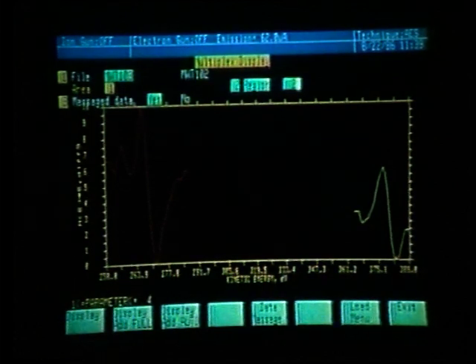If we would have done 3 sweeps on the carbon, we would have had a much smaller carbon peak, because from our survey scan, we saw that the ratio of nitrogen to carbon was greater. But again, because we did more sweeps on the carbon, we have good statistics and we have a strong carbon peak which appears to be larger than the nitrogen peak.